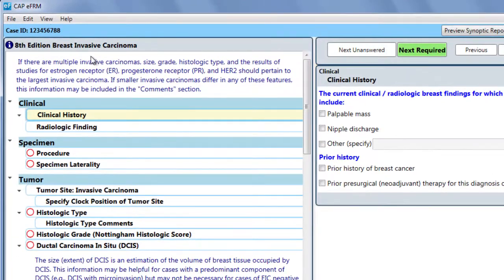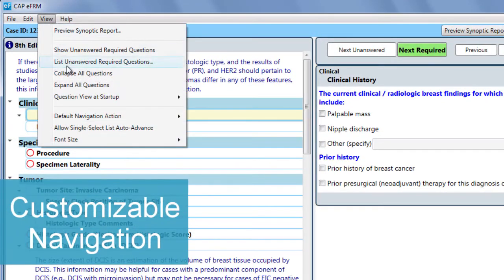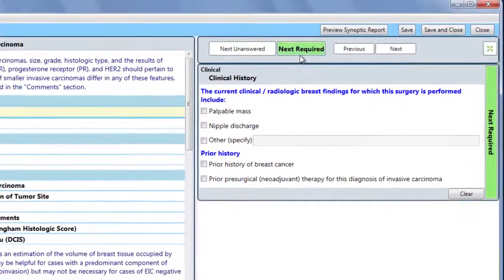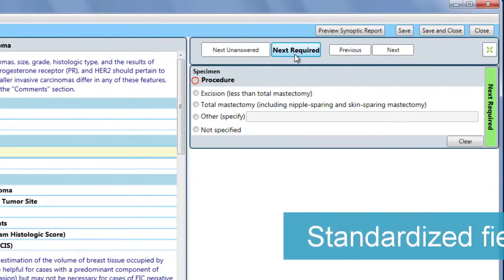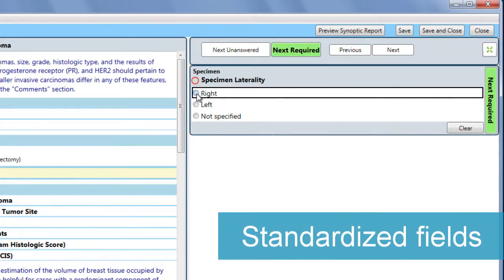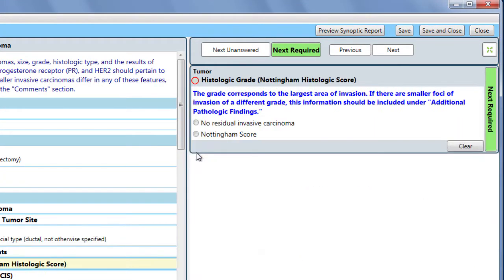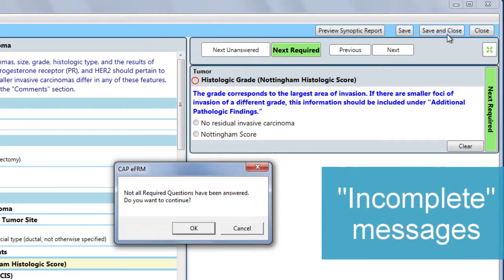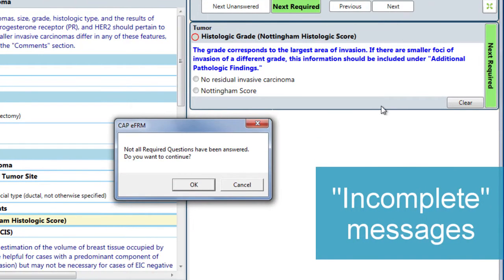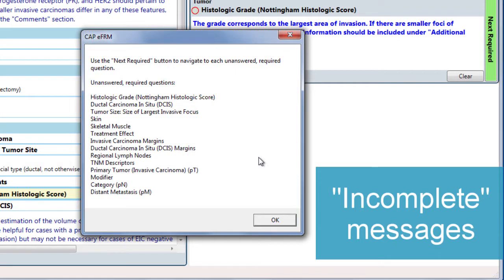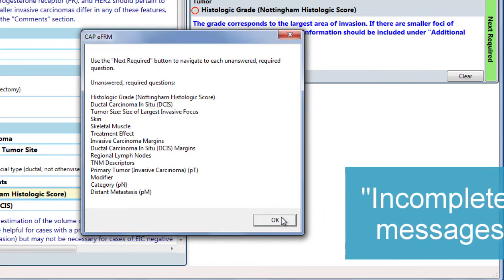You can customize your navigation preferences easily. Entering information is simple because E-Form uses standardized fields with a consistent format. If necessary, an incomplete message will appear, so you don't inadvertently close the case before you're finished reporting on required accreditation elements.